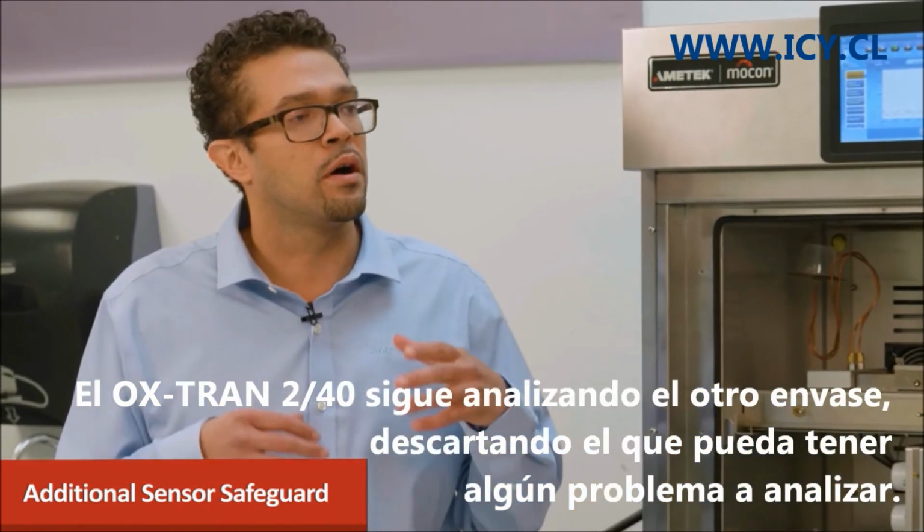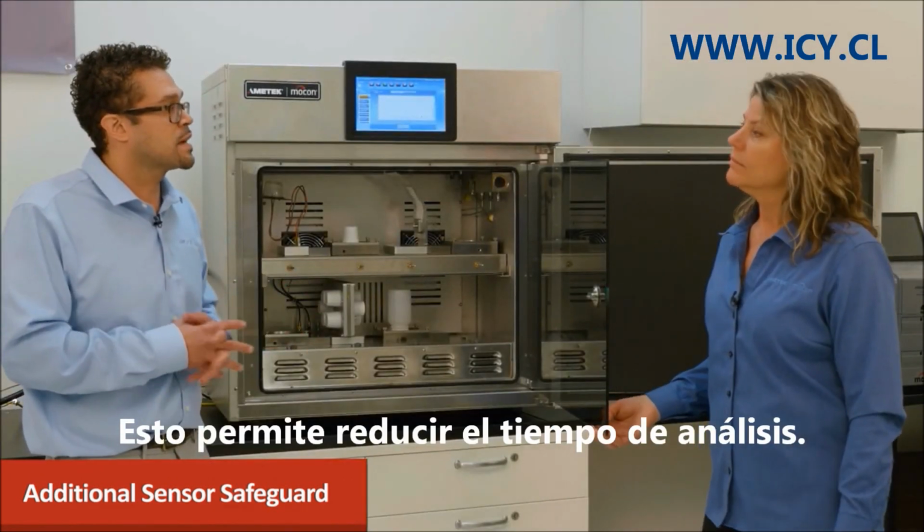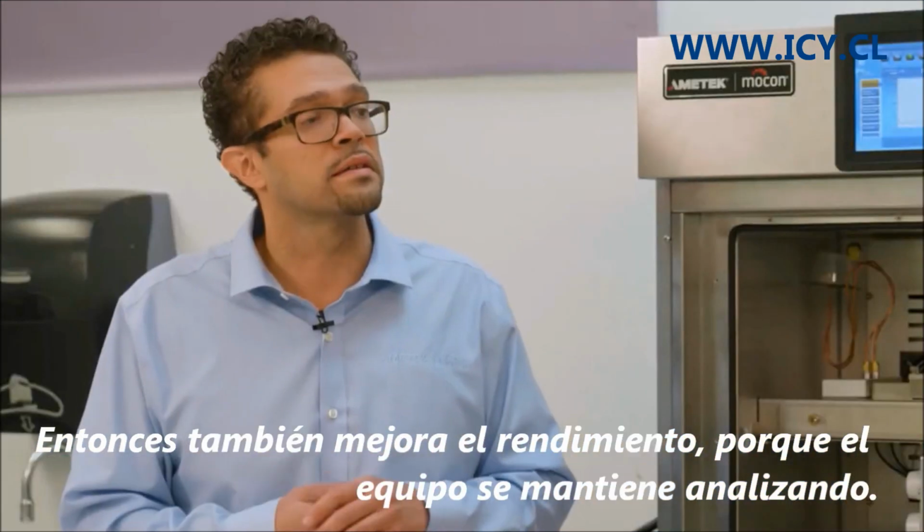And with the alterations that we have made for the sensor, we actually can test at shorter exam times as well. Nice. So that improves throughput. It just keeps testing going. Exactly. Very good.